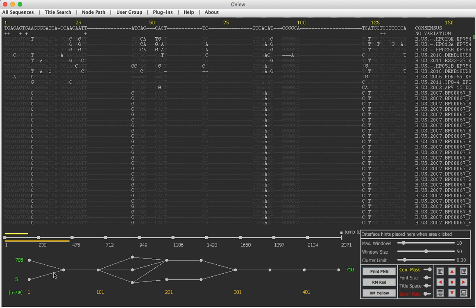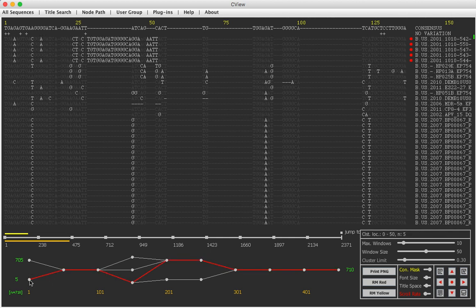When the user clicks on an individual node, the path of all the sequences passing through that node are highlighted in red on the network. These sequences are placed on top of the sequences in view within the sequence display area, and a red circle is placed beside their title to remind the user that they are passing through the selected node. In addition, the number of sequences passing through the clicked-on node will be displayed within the tip area of the control panel on the bottom right.